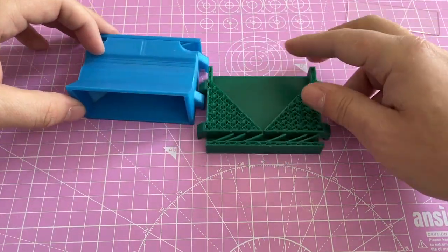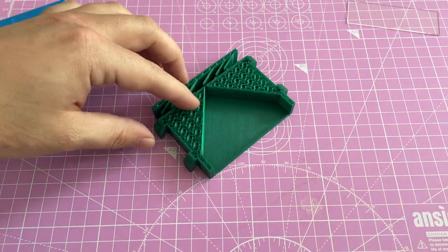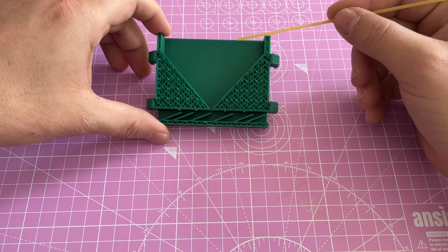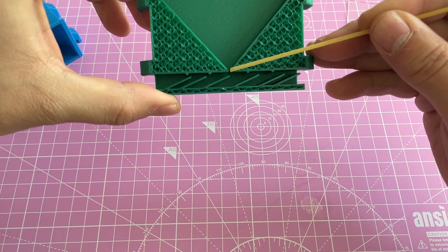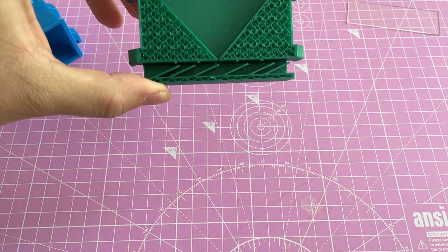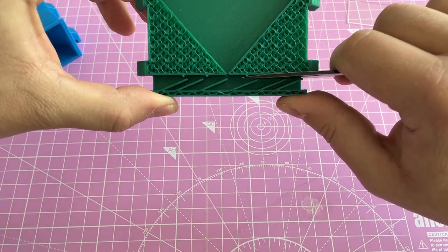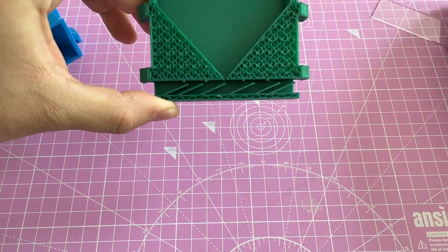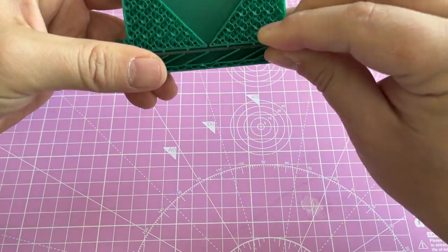I have a nice cut-up here, so it looks like this. And this one does one simple thing. It collects air from this part here, it accelerates the particles, and then here there is this small slit that will focus the particles on your glass slide. Those small fins are for keeping your slides, and they are printed in one piece and just work for keeping your slides stable in this position.